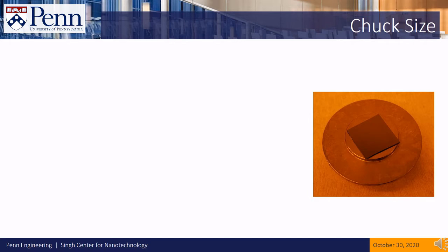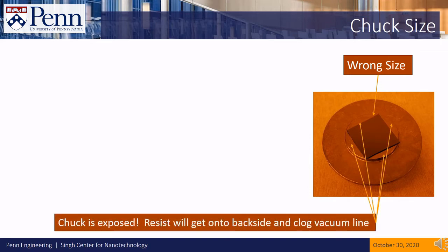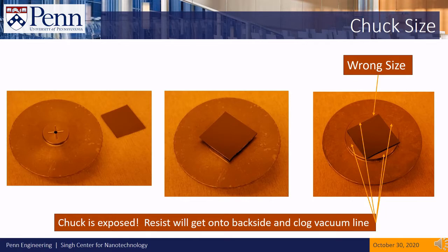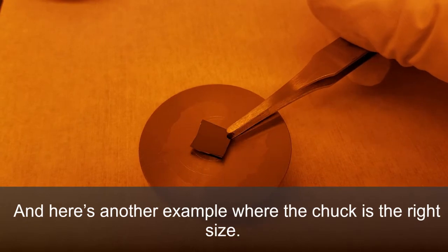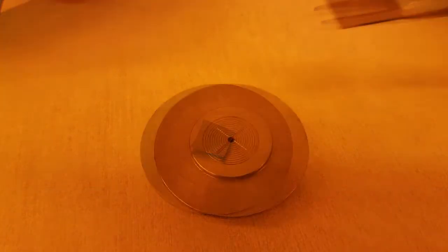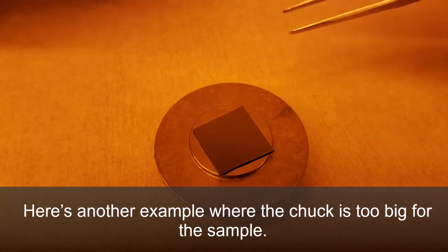Let's look at examples of how to pick the right size chuck. This chuck is too large for this sample — although it may look okay at first, resist will get onto the back side of the sample and down the vacuum line. This sample and chuck are the right size for each other. If you are not sure whether the chuck is big enough, try running a test spin with no resist before you run the real spin. Here are additional examples of a correctly sized chuck and one that is too big for the sample.